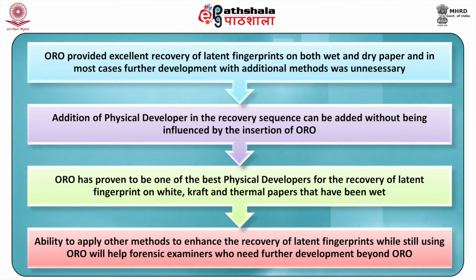Results indicated that on its own, ORO provided excellent recovery of latent fingerprints on both wet and dry paper, and in most cases, further development with additional methods was unnecessary.